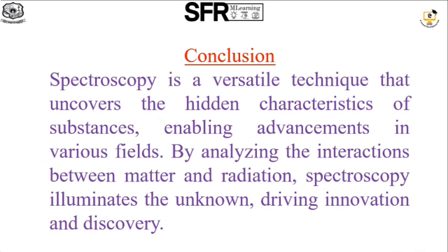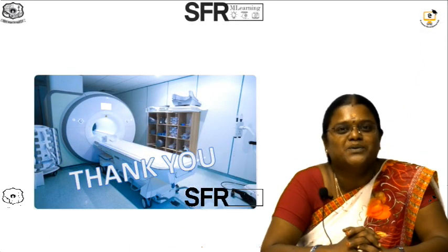Conclusion: spectroscopy is a powerful analytical tool that reveals the secrets of matter, helping us understand its composition, structure and properties.